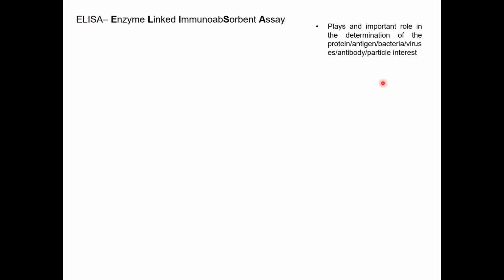In that sense, you can use part of the pathogen, or the antibodies that are circulating in your blood. So there are a lot of options to measure, and the method is going to work in a 96-well plate every time. The difference between the ELISAs is the way that the protein is going to bind to the antibody. The first one is the so-called direct ELISA.